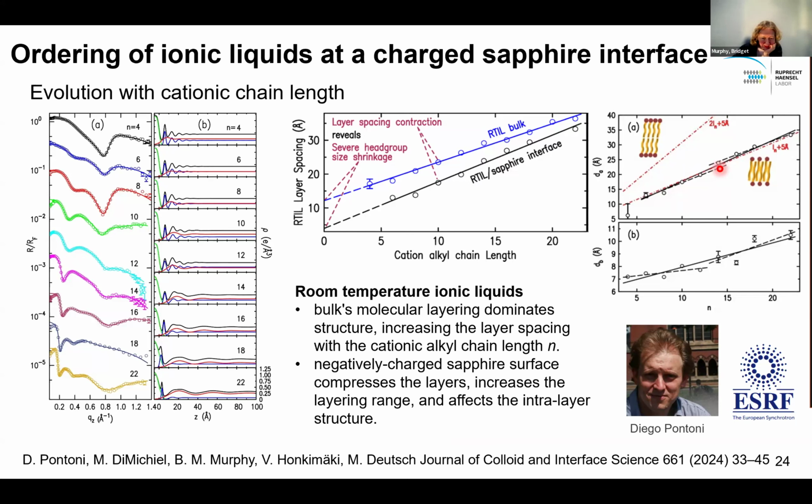Here we were trying to figure out whether we had a perfect sub-bilayer or if there's intermingling between the layers. Looking at the distances between the thickness of the layer, it is for sure not a perfectly separated bilayer.